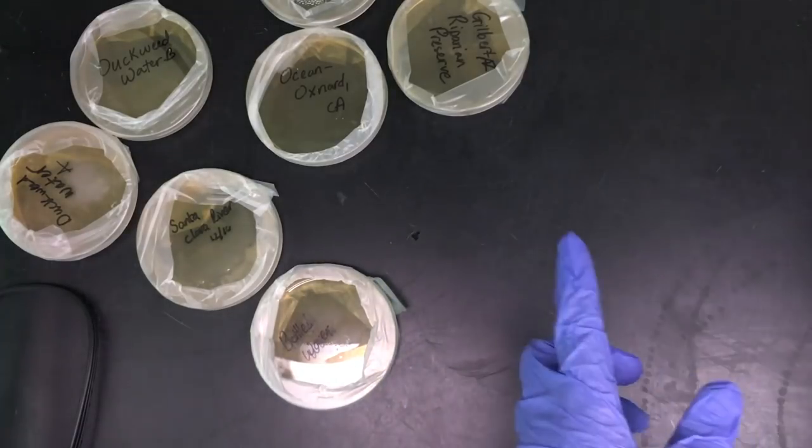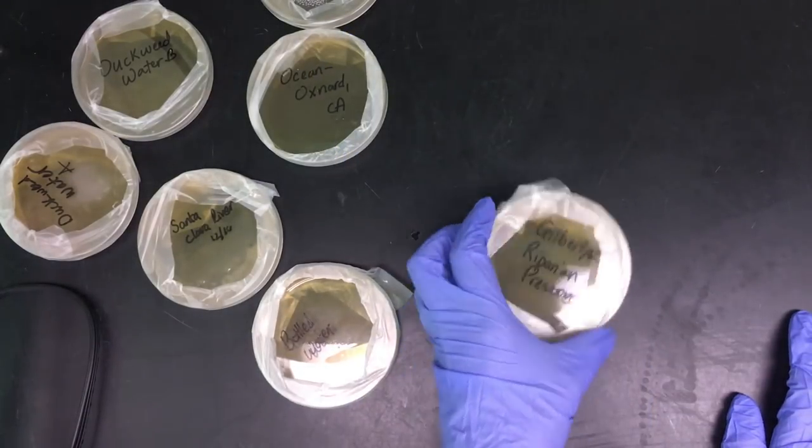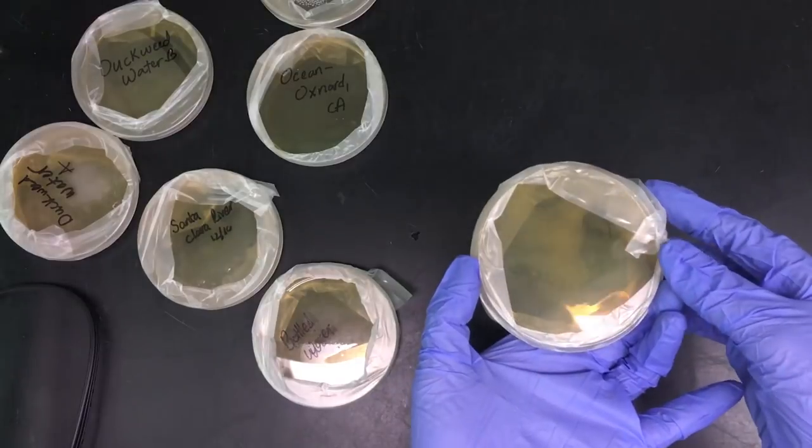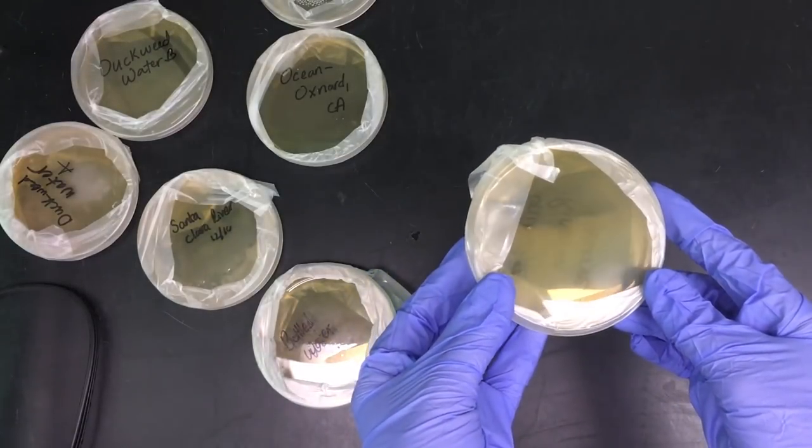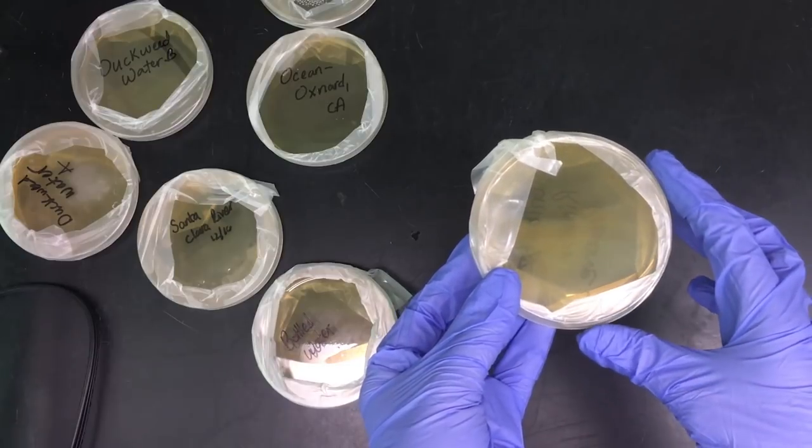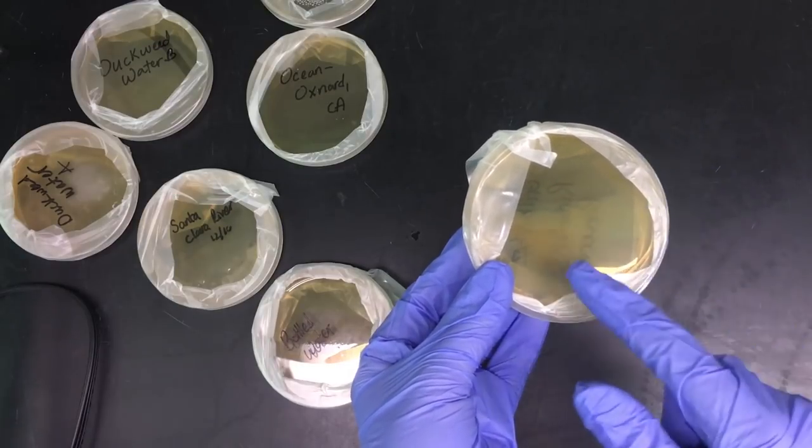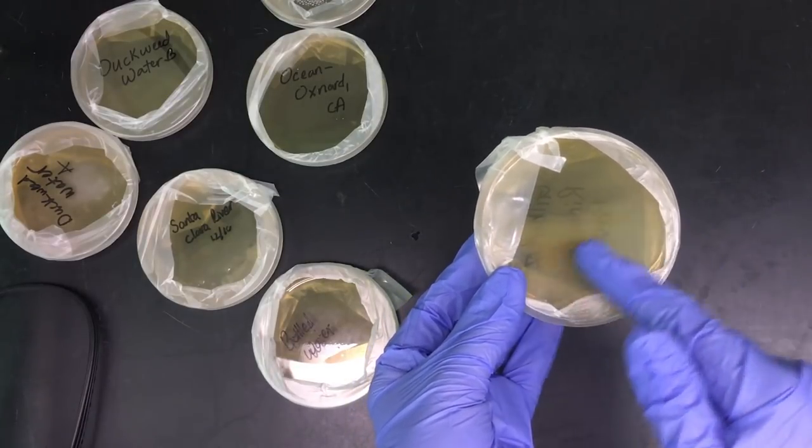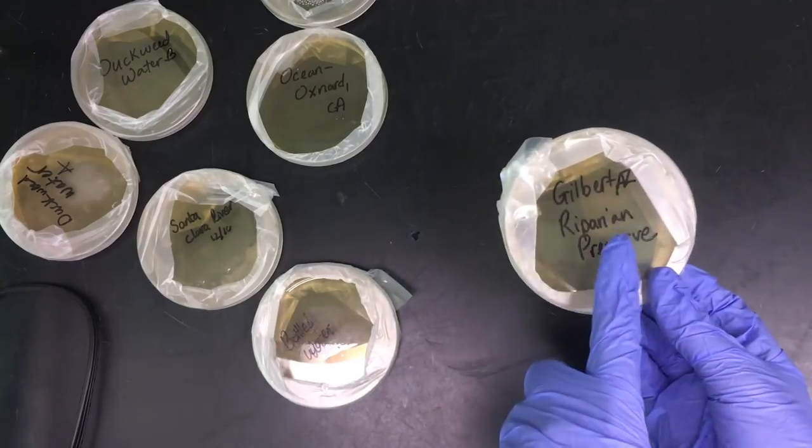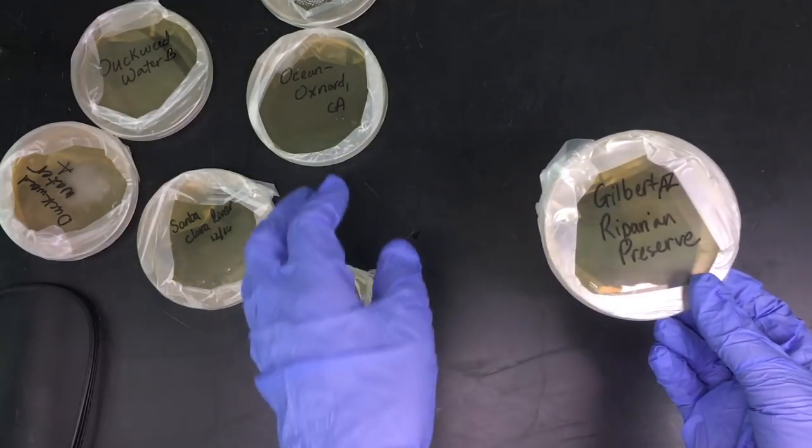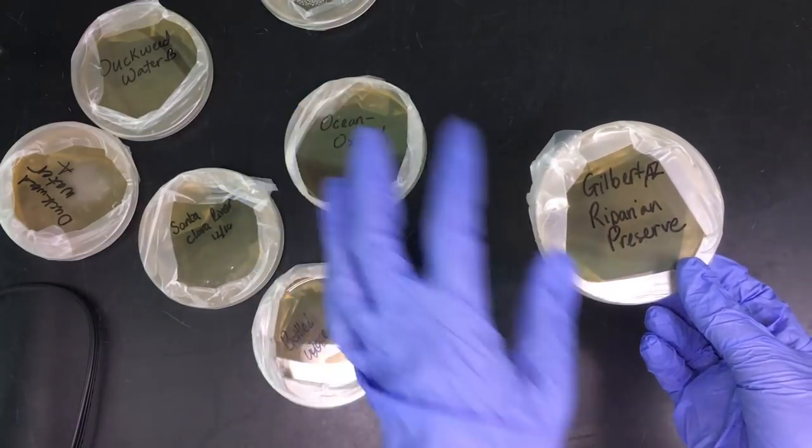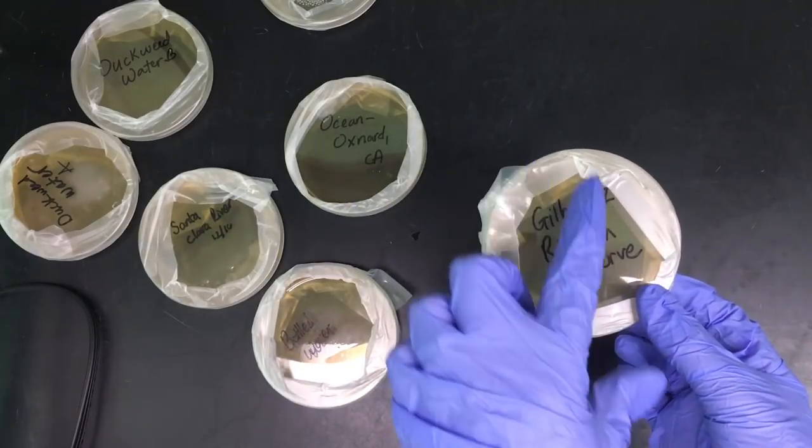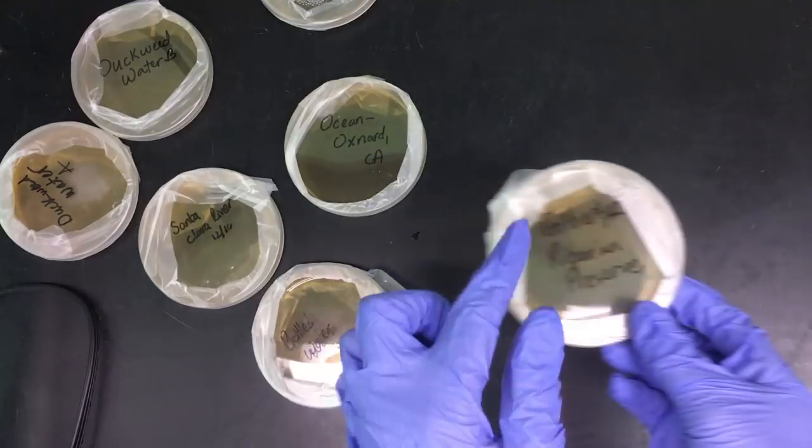The next one is from the Gilbert Arizona riparian preserve and this was treated wastewater. This has come back negative. Now it has some bacteria in it but not coliform bacteria. This was mostly ducks and those are not mammals so we are not getting any fecal coliform which is good because this is actually treated wastewater. You wouldn't want any fecal coliform in your treated wastewater. It could have some if some mammals were living nearby and their waste washed in, but it doesn't look like in our water sample we have any of that, so this is negative.